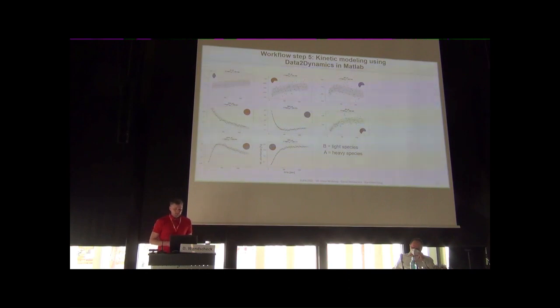The results look like shown here. For each species, we have the experimental data denoted as stars, the fit as the black line, and the confidence interval for the fit in gray. We have a full set of species that have a low intensity in the mass spectrum and therefore get a larger confidence interval by the fit. But we also have, especially for the trimers, a quite good model of the abundance over time.